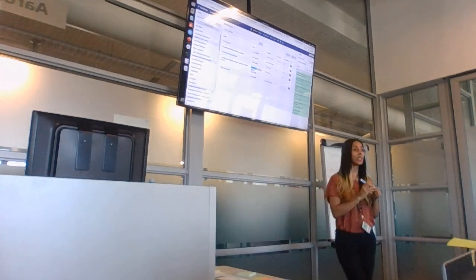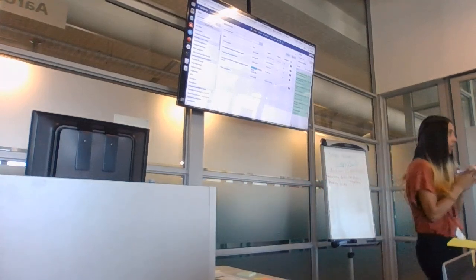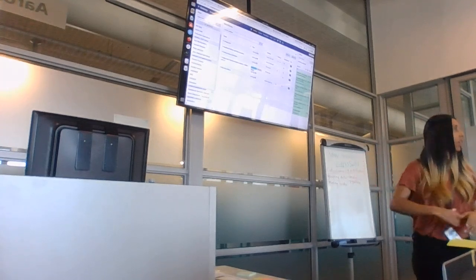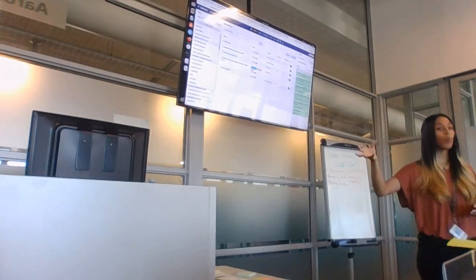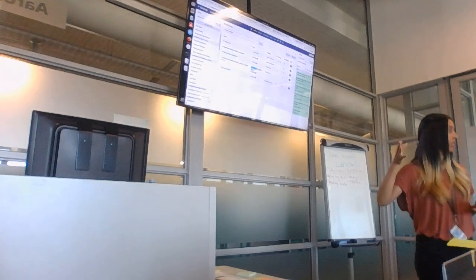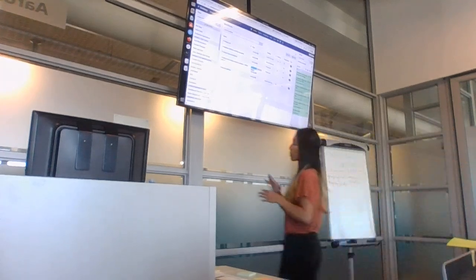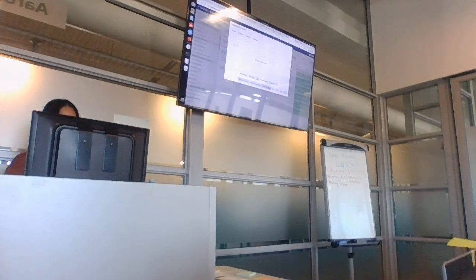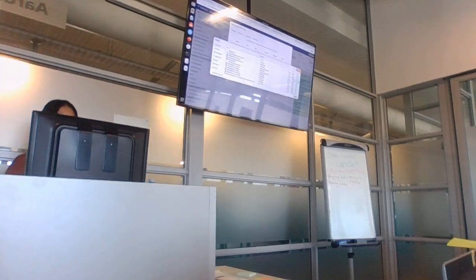Okay, what we did after we did the introduction was, I gave you 10 files, and I asked you to import those 10 files to your computer. I'm just going to show it, follow along. We clicked on this button, we pasted, and some of you didn't use the paste function, but you could paste all of the files here, or you could go to choose local files and upload your files from there.